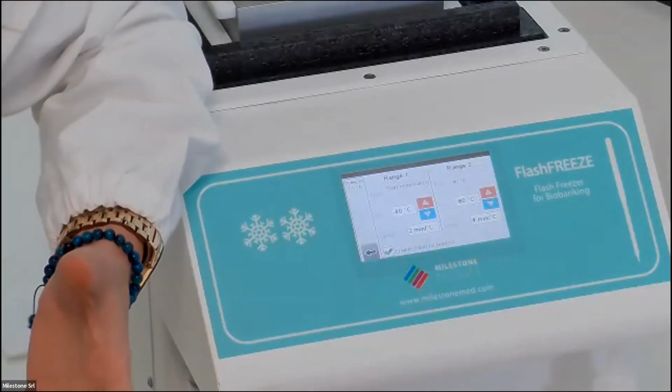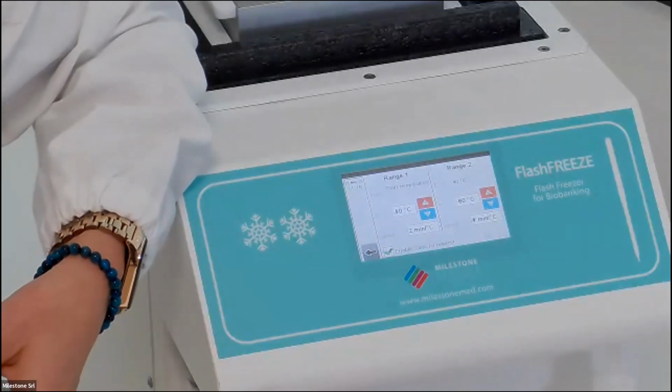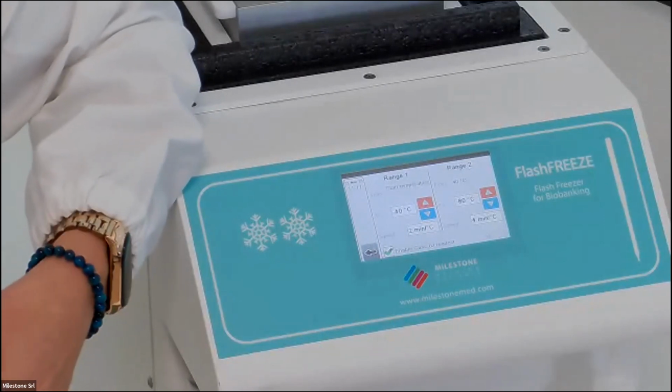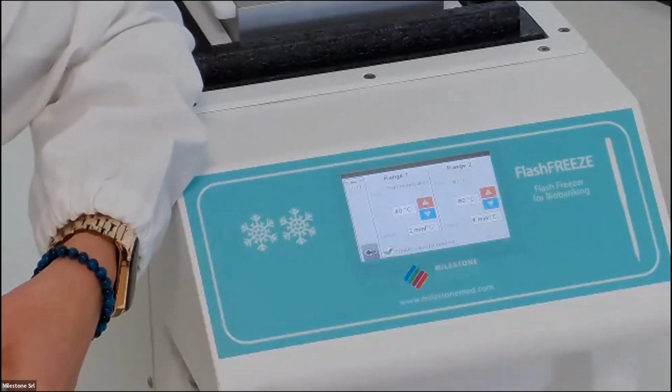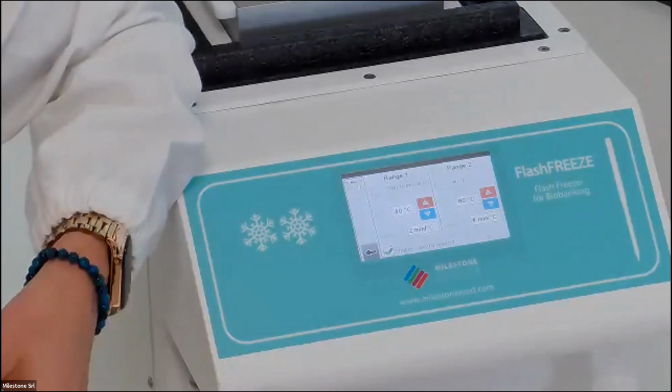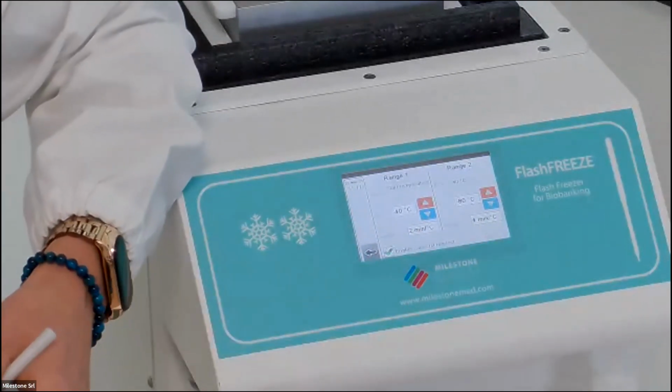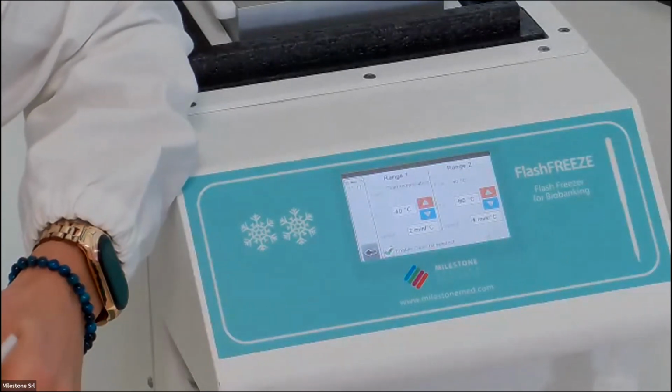Because as you know, at very cold temperatures, all the transfer, all the movement, all the action are dramatically reduced, are slower. So maybe it's better to freeze at a slower rate.